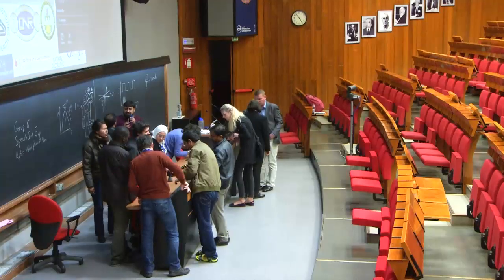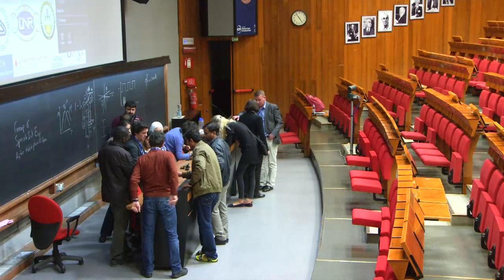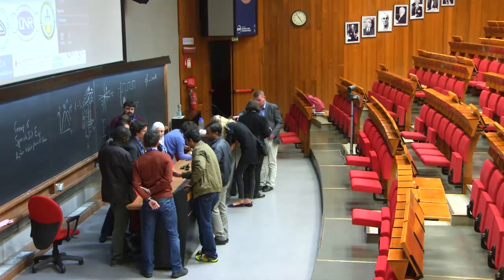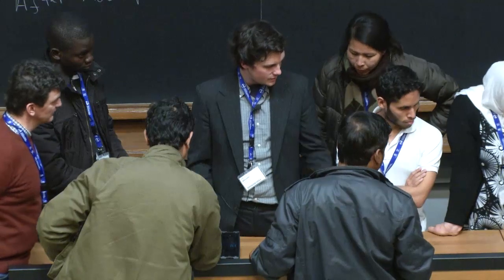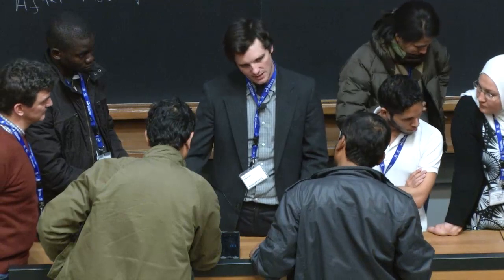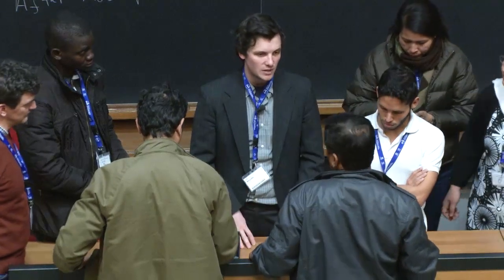Is it possible to use your computer, with software, perhaps duplicating the screen? Programming on your computer is much easier than doing it on the phone. Or you just text yourself the image. For the Giardia one, I did a demo just a couple of minutes ago. I sent the image through the Wi-Fi here to Los Angeles to our server. It processed the image and sent back the results. But yeah, you could do that with a local connection too. Yeah, why not?